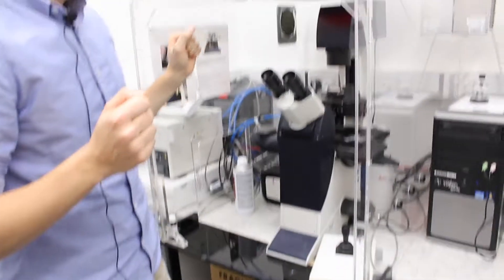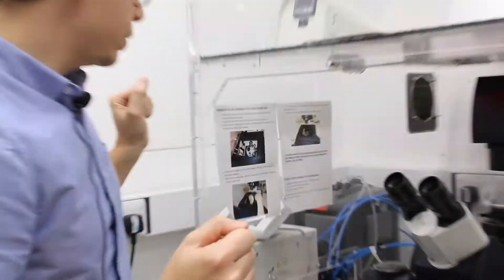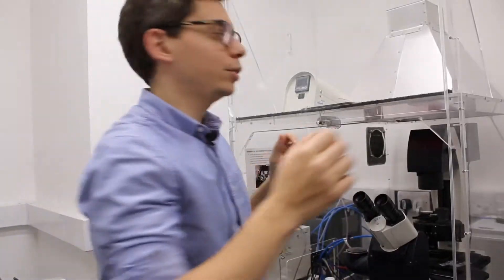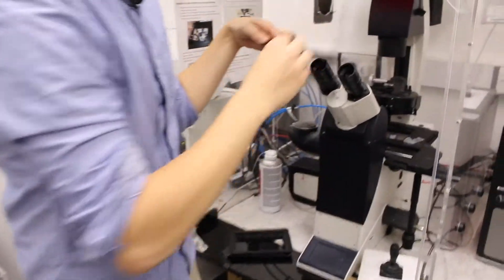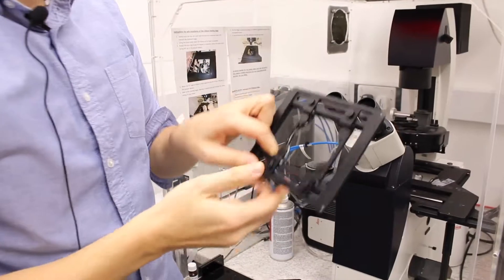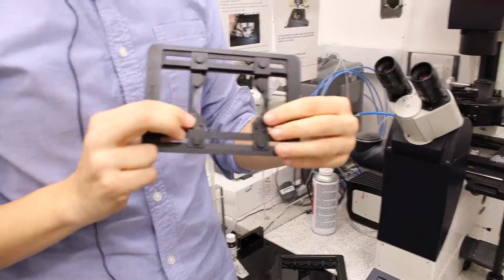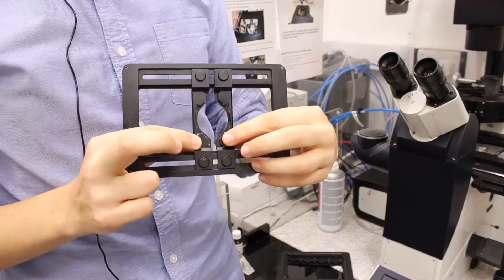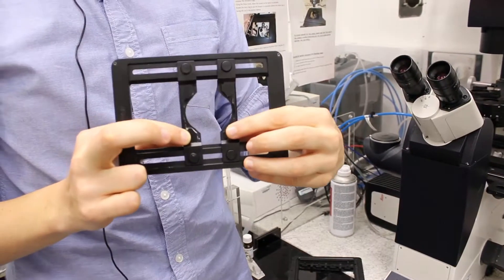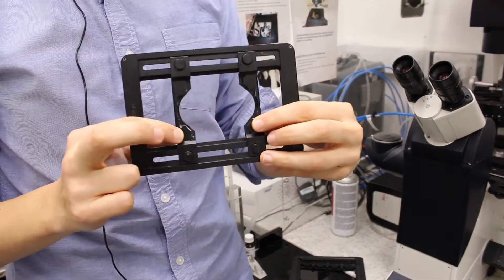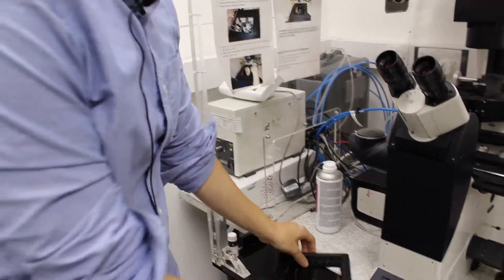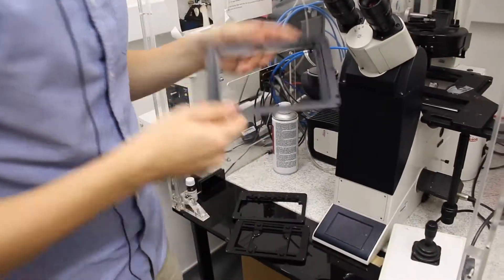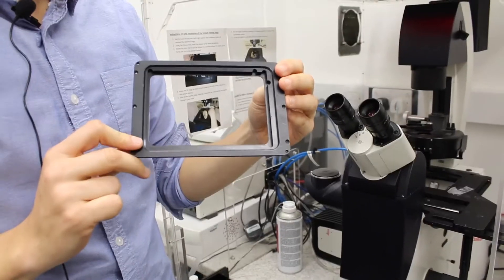To load the sample, there are three different sample holders. The most conventional one is this one, so you can adjust the size of the sample. And there are two others. One is for the well plates, you can put well plates on that.